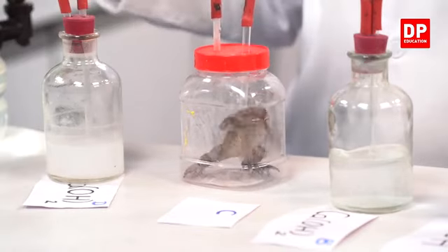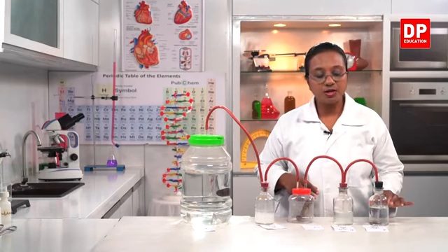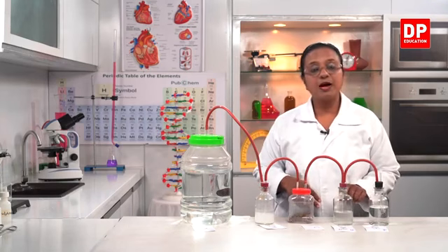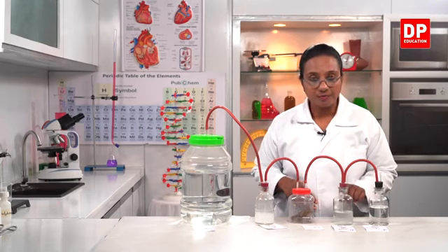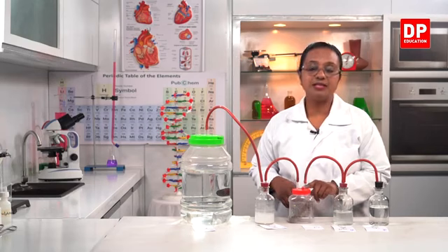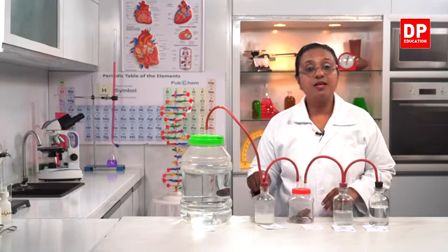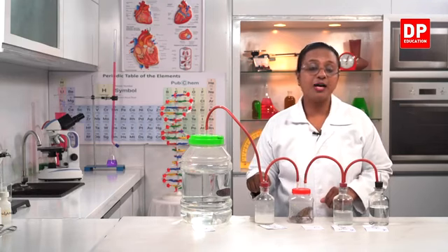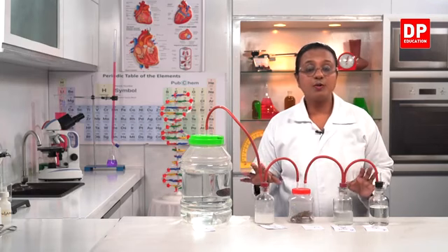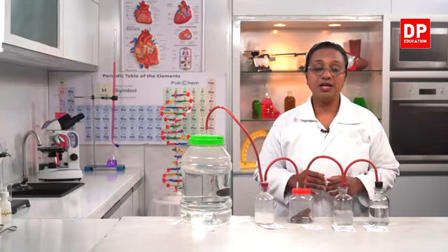So this is the activity. Initially when there was air here, carbon dioxide was absorbed in this bottle by KOH. So therefore there is no color change with calcium hydroxide, that is lime water, in bottle B. But then the air comes into this bottle, so the frog respires, releases carbon dioxide, and that carbon dioxide gives a color with bottle D, the calcium hydroxide, that is lime water, present in bottle D. So that is the observation that confirms that carbon dioxide is released during respiration.